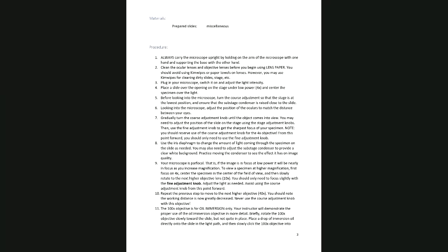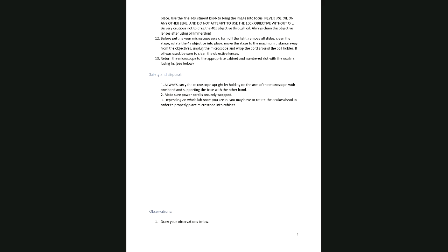But for some reason, that's always taught to students, and I don't know why. If you want to lower the stage and start all over again, you can do that, but you're making it harder on yourself. All right, so again, when you're finished using the scope, you clean off all the lenses, wrap the cord around it, and put it back where you got it from.